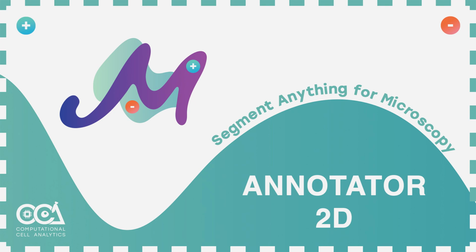In this tutorial video, we'll be learning about how to use the 2D annotator and the features like interactive and automatic segmentation in Napari using the MicroSAM tool.